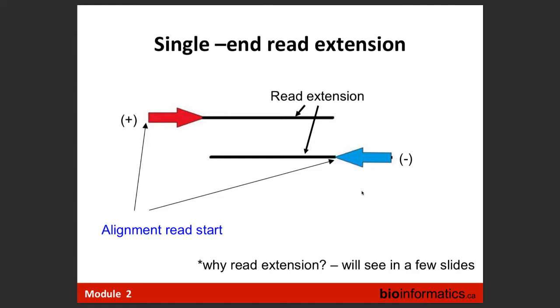So now, when we have a single-end read and we're extending the read in some direction, that is important. We have to extend starting from here, not from here. Is it clear what I was talking about here? Okay. There are still quite a few single-end libraries around, people are still using them a lot, so this is still maybe an issue. That's why I would like to mention it.